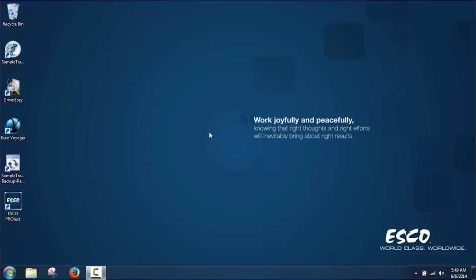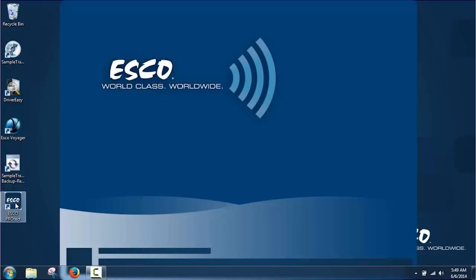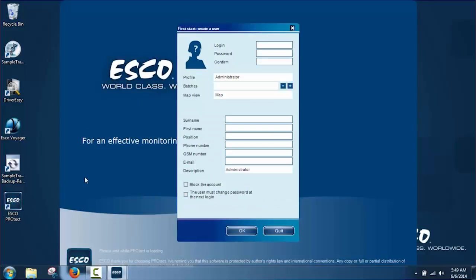Now let's see how the ESCO ProTech software system works. To run the ProTech software, the user double clicks on the ESCO ProTech icon. Once ProTech is launched, the user can login by keying their username and password.